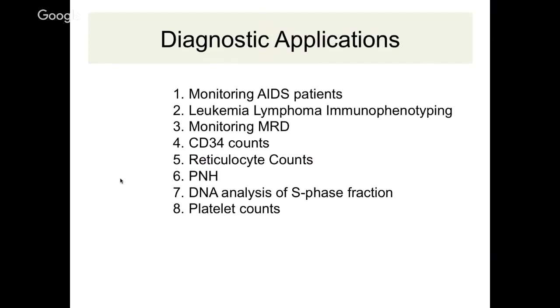What are the applications of flow? These are the common applications. We monitor the HIV patients. We do leukemia and lymphoma immunophenotyping, and many more. The first and second are the commonest applications. Leukemia immunophenotyping is the topic for today.